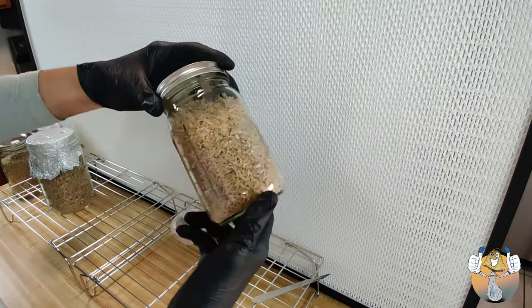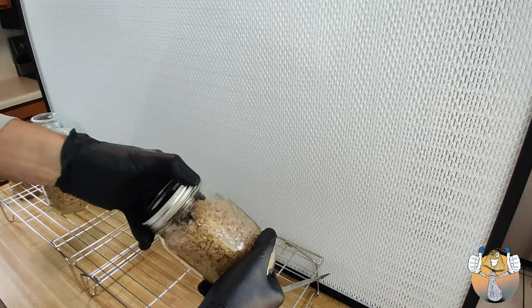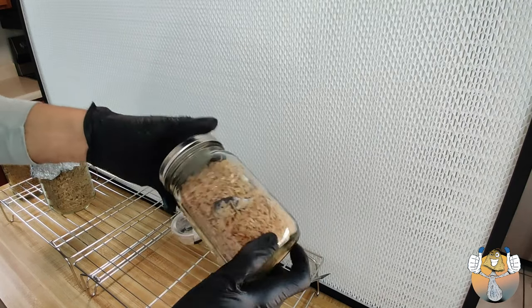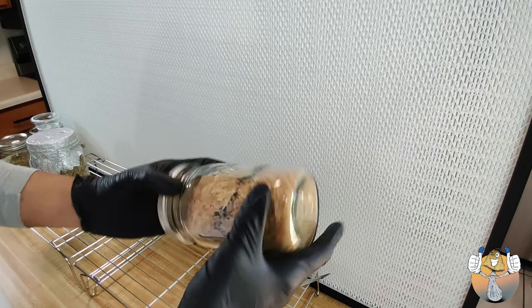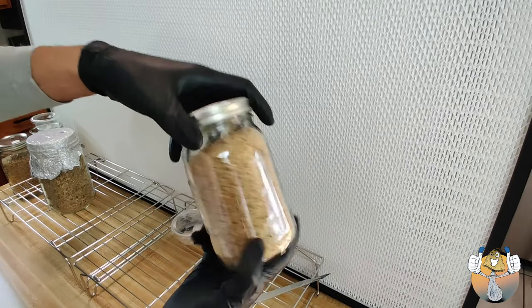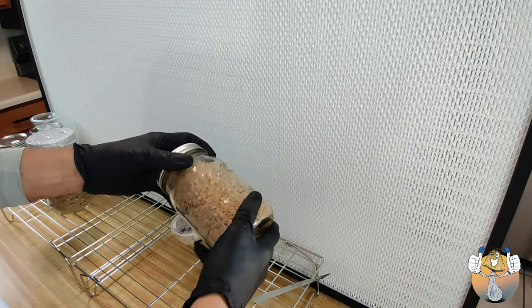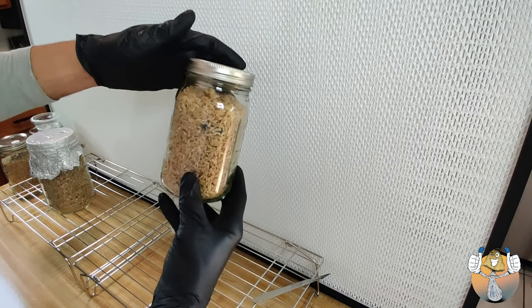Just want to show you guys what it looks like when the agar actually has some color so you can see it. And that little bit of a vibrating shake definitely worked out for me. And a little bit of a razzle dazzle at the end. Make sure everything is distributed evenly. Now you've got to be careful. The agar loves to stick to the glass. And once it's stuck to the glass, it's kind of stuck to the glass. So you want to just move swift with that shake.